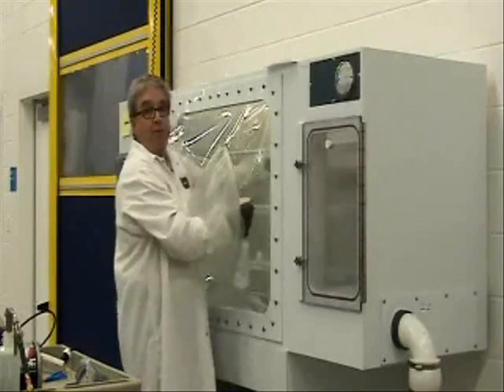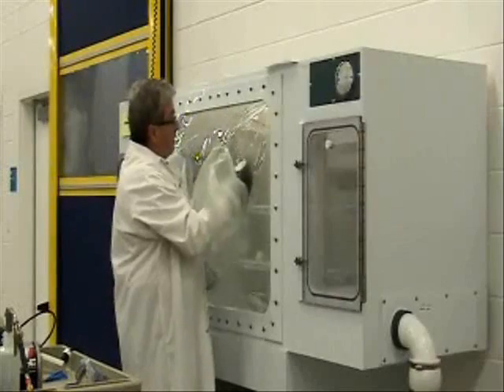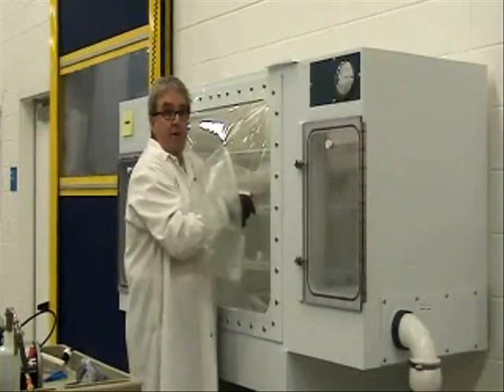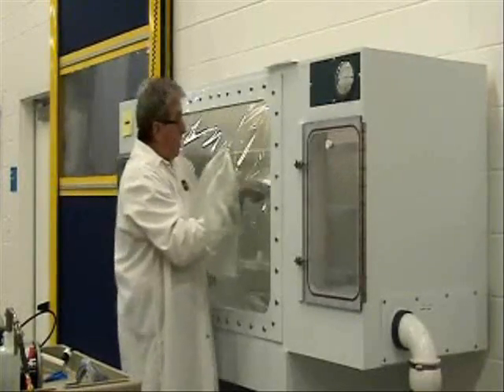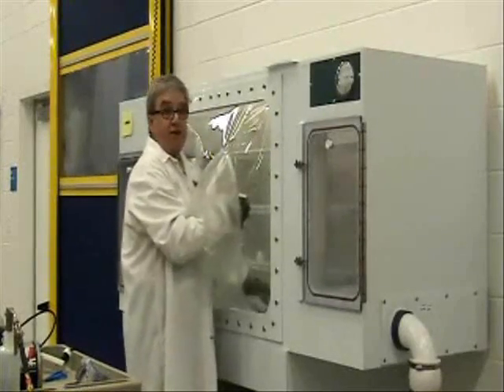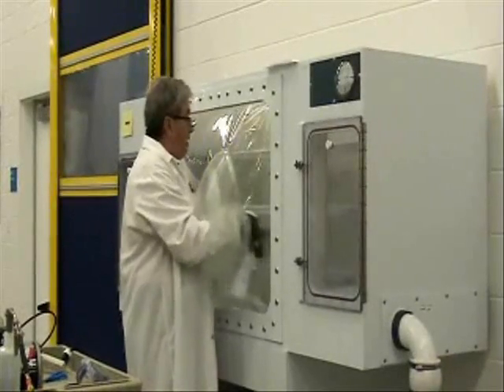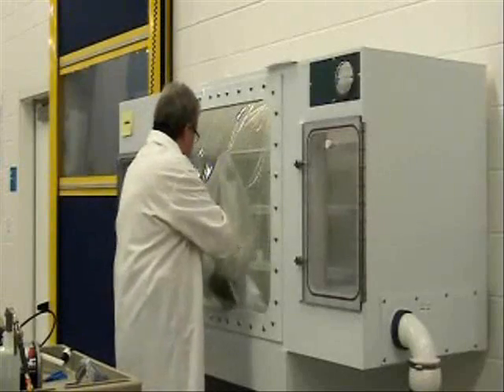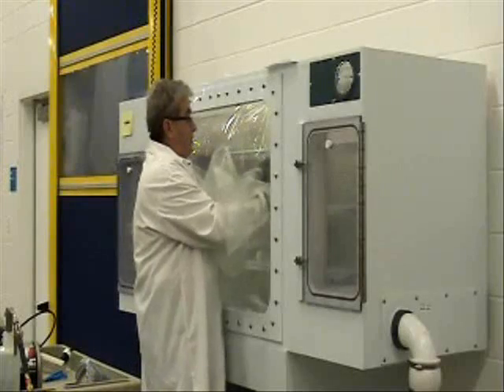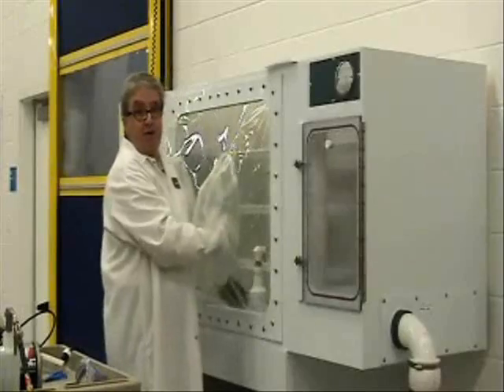That also includes whatever equipment you have in the isolator. Here I have a cage — I'm going to wet the cage, put it back on the shelf, then move on to the next cage and completely mist it: top, bottom, inside, outside, all surfaces. Then continue spraying the floor. Before you put the cage down, spray the floor first and put the cage down on top of a wet surface, so you've got good coverage throughout the isolator.